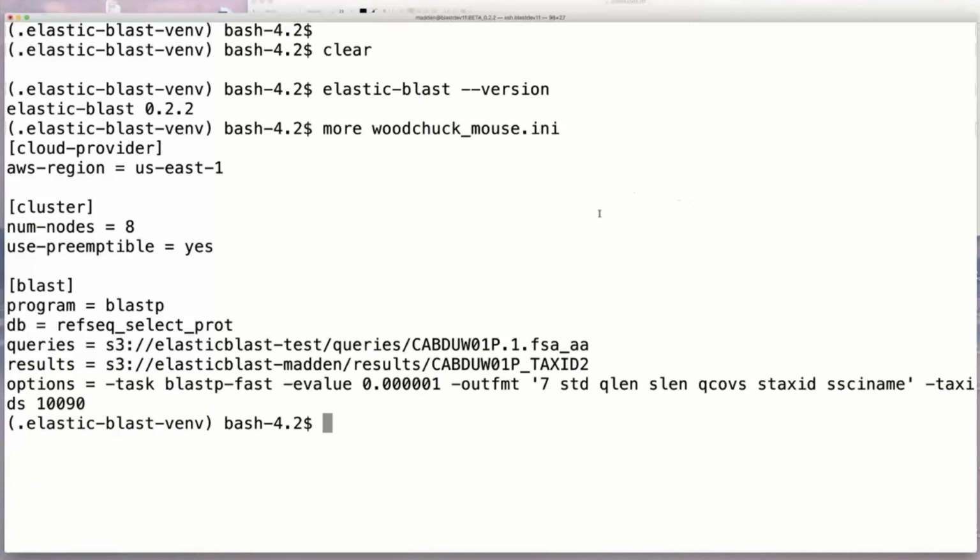Okay, the configuration file has 3 sections. Well, actually, let me step back. As I mentioned, we have pretty good documentation and tutorials that walk you through your first search. So don't sweat all these details right now. I'm just going to sit back and absorb them.